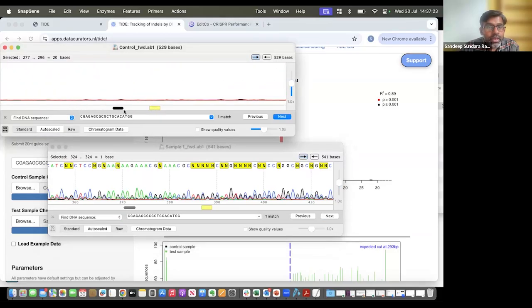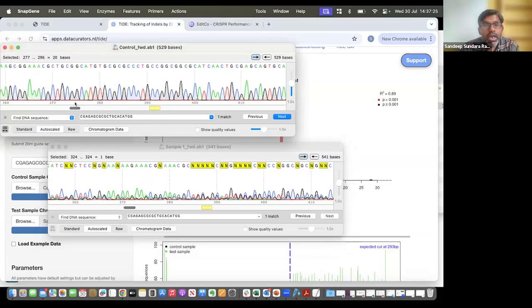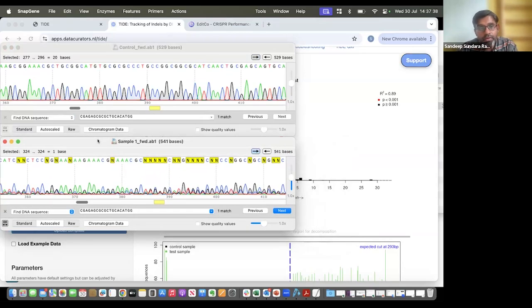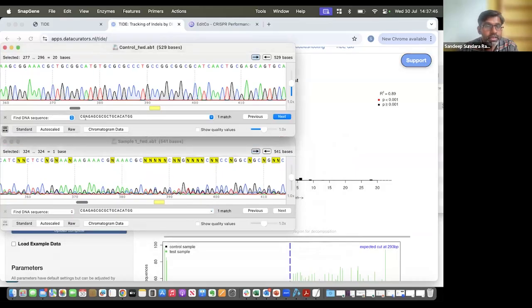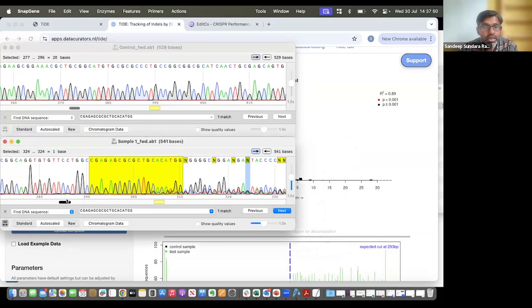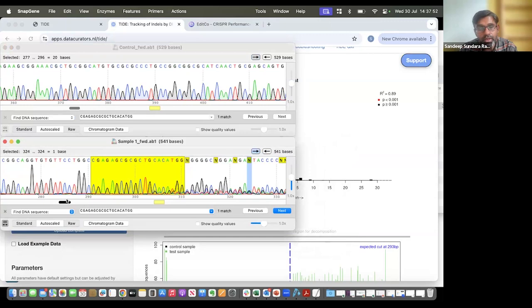And that provides us with an opportunity. If you want to get an idea of what sort of things it has manipulated within that particular experiment, doing an NGS will give you far better resolution than your TIDE analysis. The TIDE analysis, or even this particular analysis, just finding a site and telling you whether it's edited or not, gives you confidence that the pool of cells you're working with has undergone genome editing and you're proceeding to look into the next step.